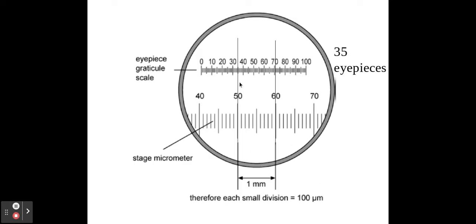Here you can see that I've got 35 eyepieces between these two lines, and I know that those 35 eyepiece lines is equal to one millimeter. So if I know that 35 eyepieces equal one millimeter, I then therefore know that one eyepiece is equal to 0.0285 millimeters.